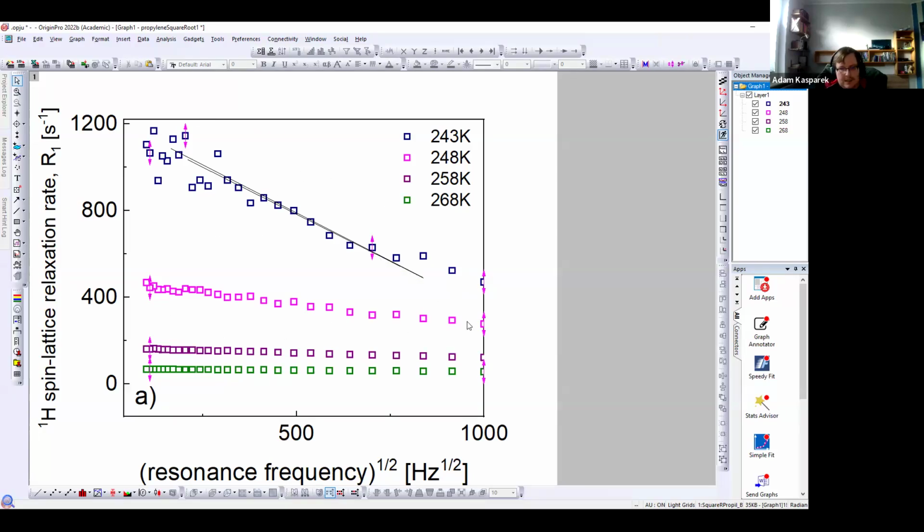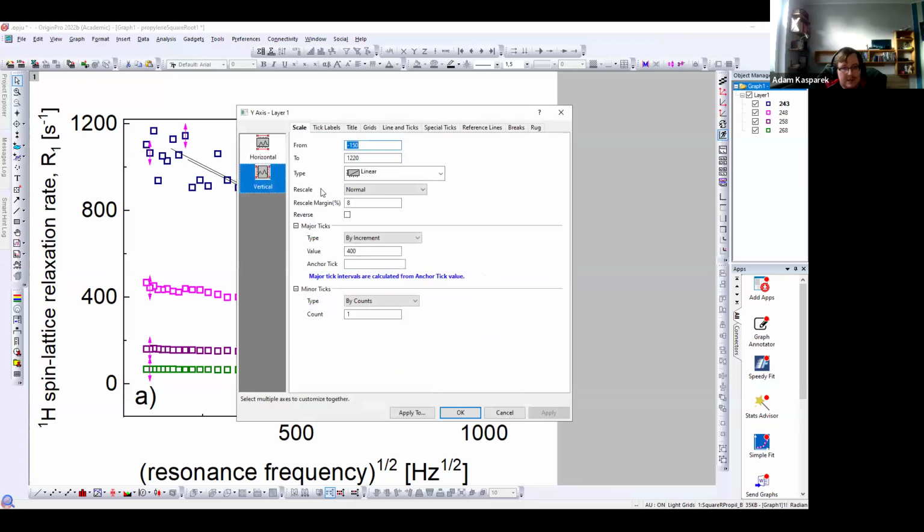So now let's go to another example. For example, this 200, the second one, and let's read, because right now it changes so slowly that we cannot see how it changes. So let's change the scale here to 500, let's say, and here -50.